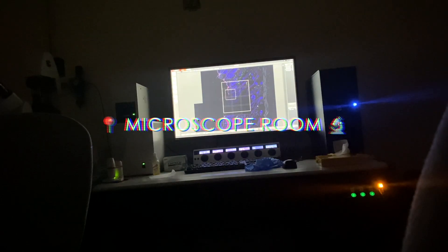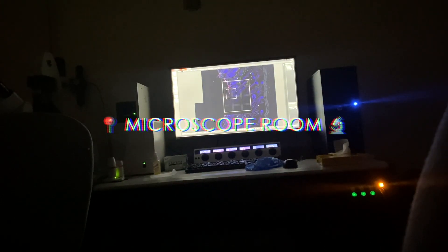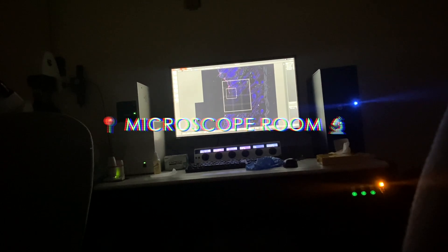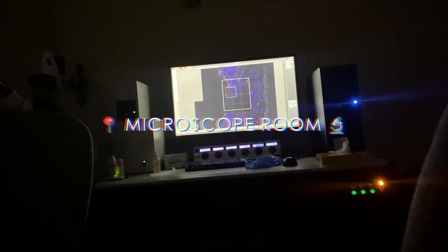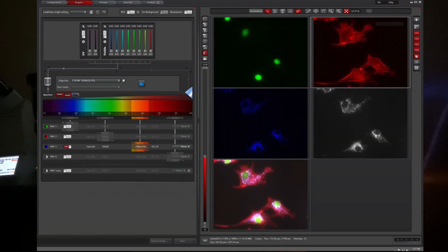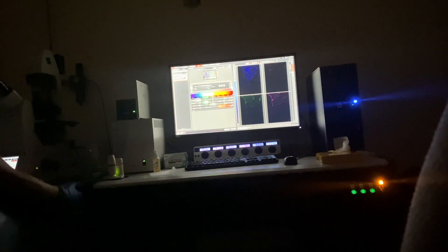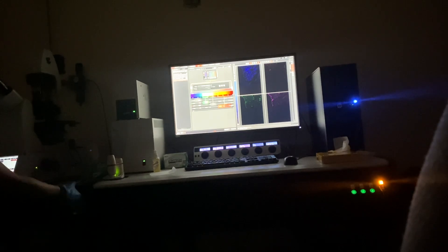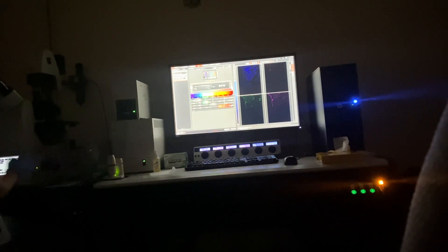So this is the microscope room, or one of the rooms within the microscope facilities. And you can see on the left, this big white and black thing. And then there's a computer attached with the program for imaging. I'm always alone and in the dark for this. So I listen to music to keep me going and sing if I'm alone. Today we're listening to Sousa.